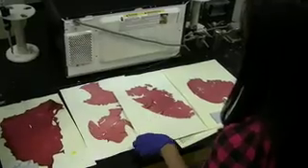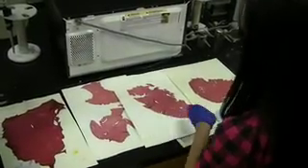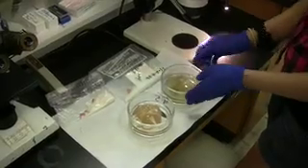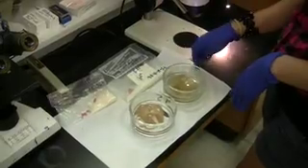These are all Halomania. They're important for the tree of life and we're sequencing them to tell the difference between each one of them. For morphological purposes, we preserve them in formalin, and when we're ready to do extraction, we have them in silica.